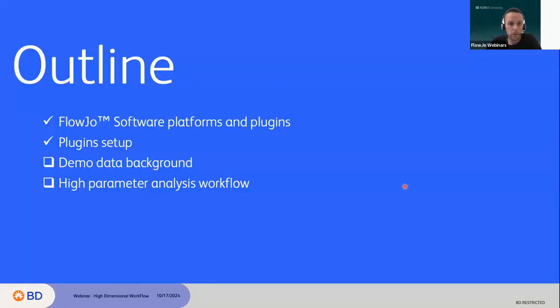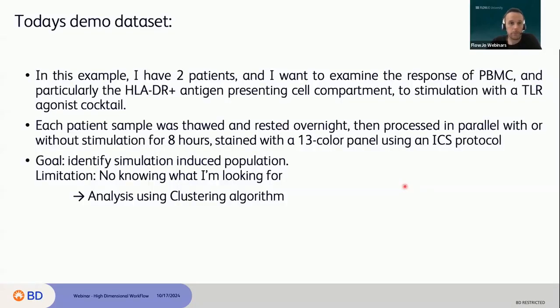All right, so let's talk briefly about the data. Today's data for the live demo is going to be human PBMCs. We have two patients. The sample is going to be either stimulated or non-stimulated for these two patients. And really, we are interested in the response of the HLA-DR population to that stimulation.